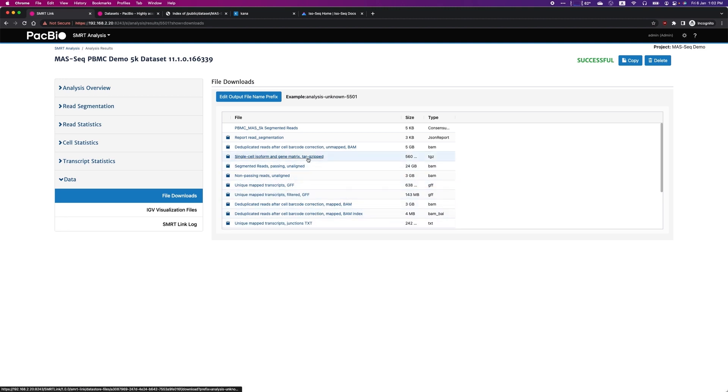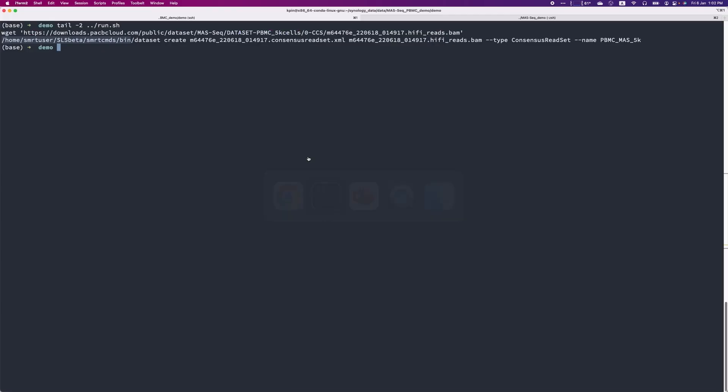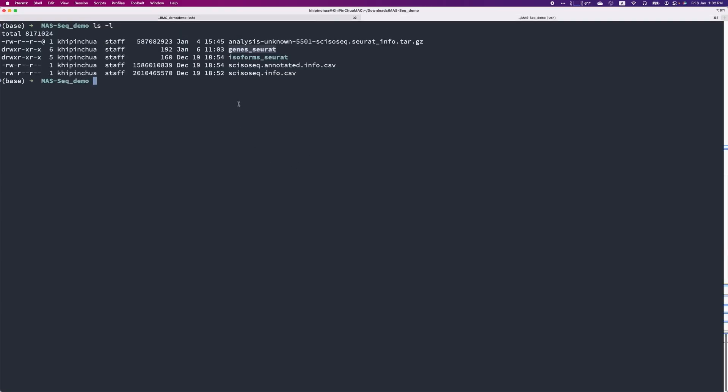For example, the set of matrix file that is compatible with popular third-party analysis tools such as Seurat and Scanpy can be downloaded here. Note that this contains two sets of matrix. One has the isoforms-by-cells matrix, and the other one has the conventional gene-by-cell matrix.